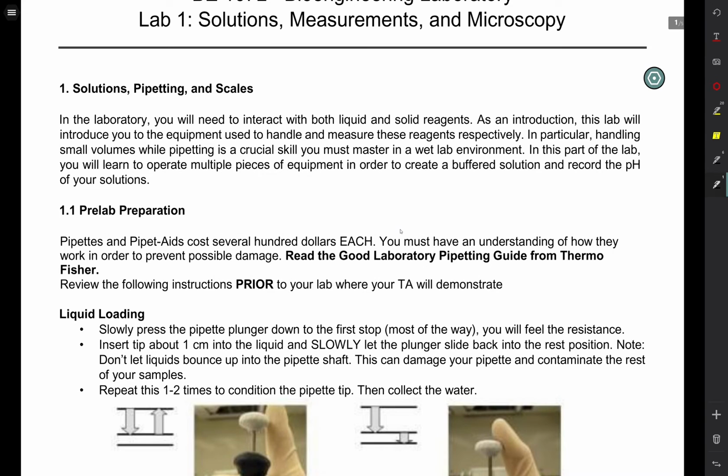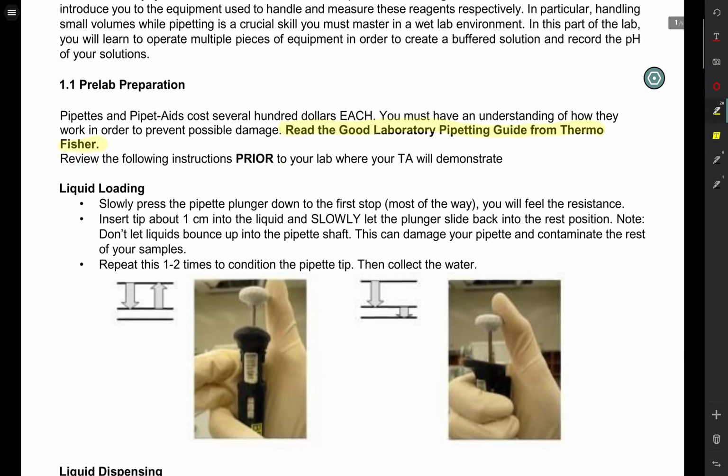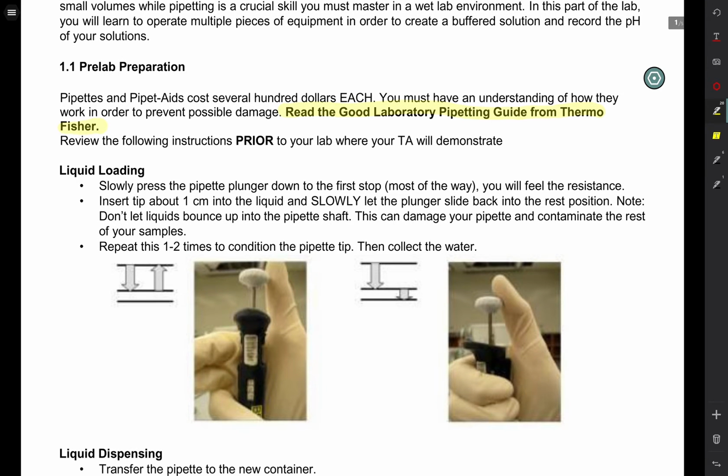Because you will be using pipettes and pipette aids extensively in this lab, it's important that you learn to use them properly. Be sure to read the posted articles, as well as pay attention to when your TA is demonstrating these tools in your lab. I just have a few tips for you guys. In particular, I think it's important that when you first start using these tools, to use them slowly. What I mean by that is when you are either pressing or depressing the plunger, be sure to do so slowly. In addition, when you're first getting your pipette tip wet, you want to expel and draw up the solution a few times, as this will help you to eject a constant volume.